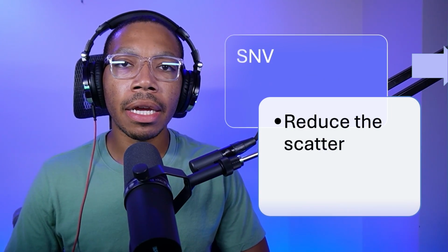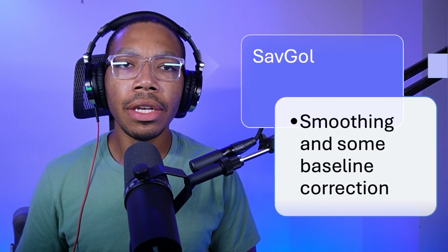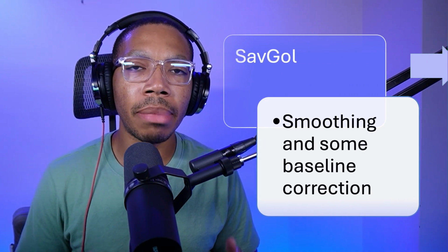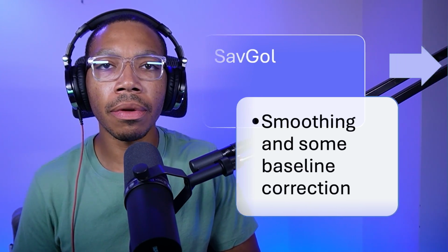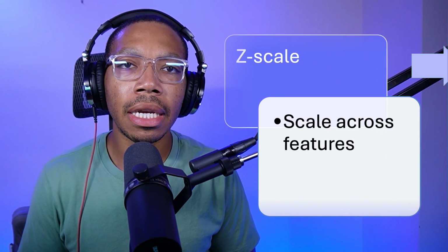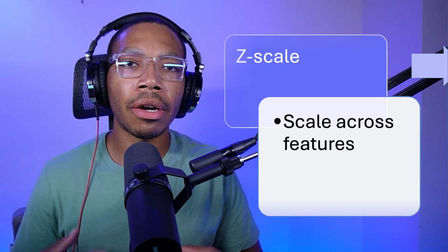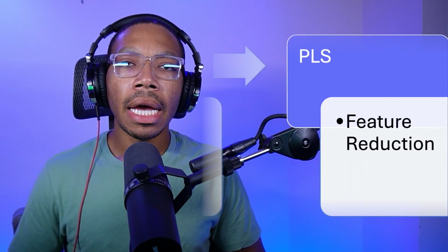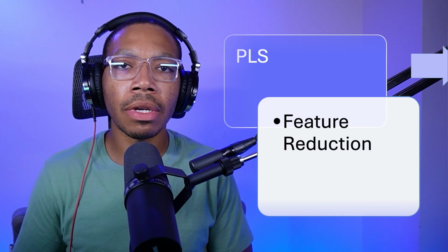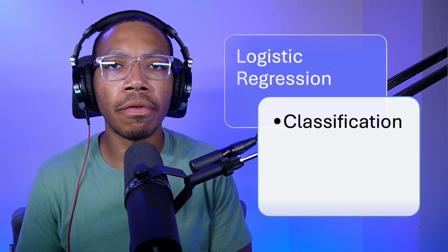So I generated a pipeline first with standard normal variate, or SNV, to help me reduce the scatter. I then used Savitzky-Golay for smoothing and some baseline correction, especially with a first derivative filter applied to this algorithm. Next, I z-scaled my data to help reduce any of the bias that might come from some of the more intense peaks and allow the model to stand a better chance at finding the significant features for building this model. Next, I used partial least squares, or PLS, not as the final step in my data pipeline, but also as a pre-processing step to help reduce some of the variables before passing into a logistic regression model for classification.